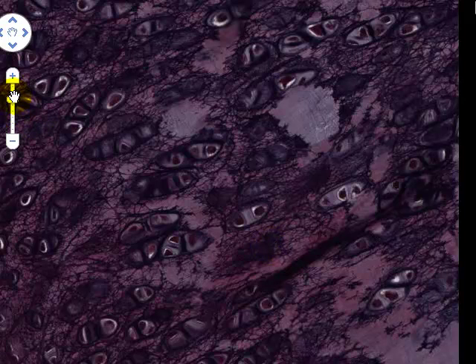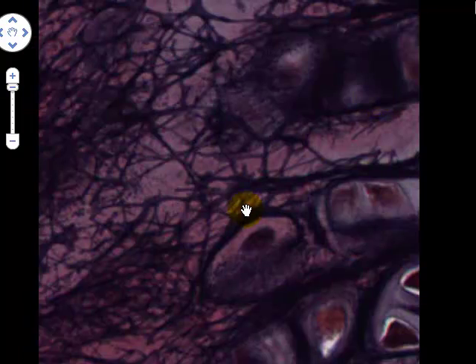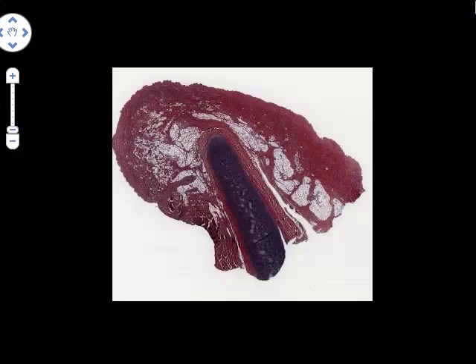And again, if we go up now to maximum magnification, here the dark lines which you can see are elastic fibers which are woven throughout the intervening hyaline cartilage in the background, made of collagen, principally of collagen type 2. And this is the classic appearance of elastic cartilage.